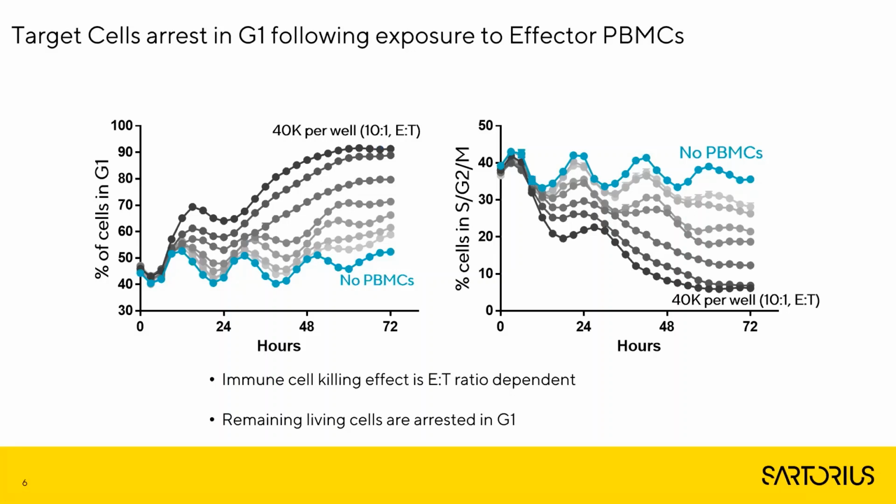Obviously, there's a correlated decrease then of the number of cells that are arrested in SG2 and M, which was a pretty fascinating effect for us, one that we have little understanding of, but one that we'd love to dig in more detail.